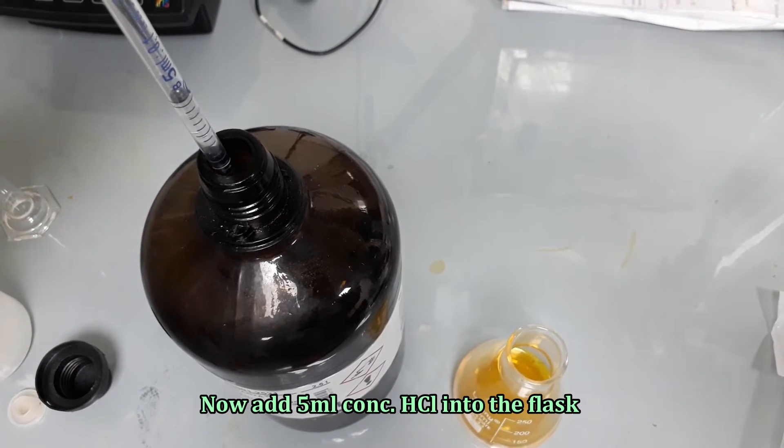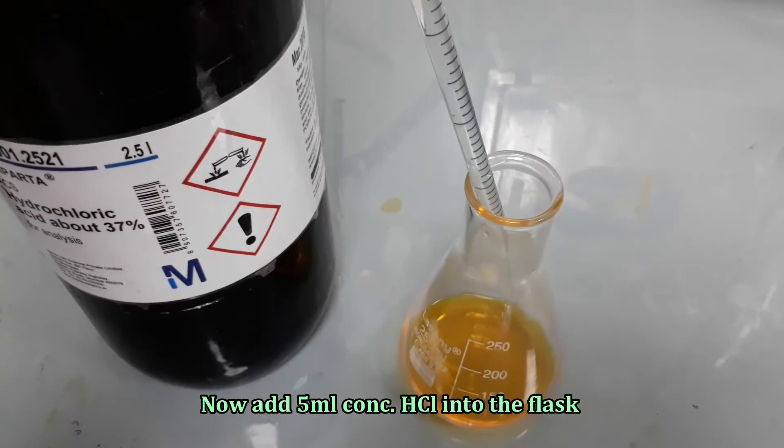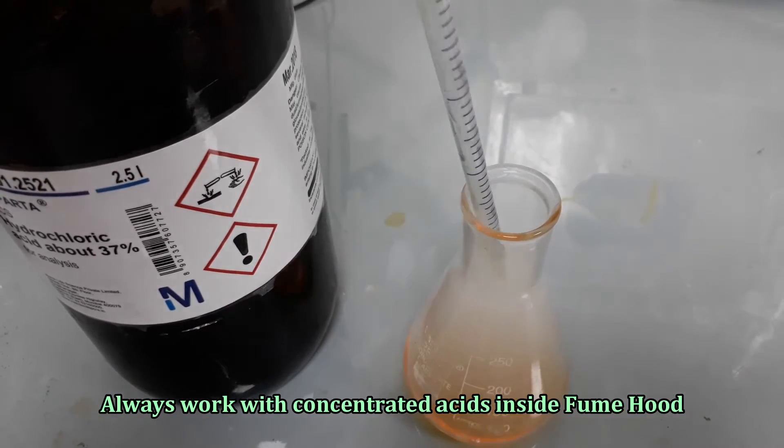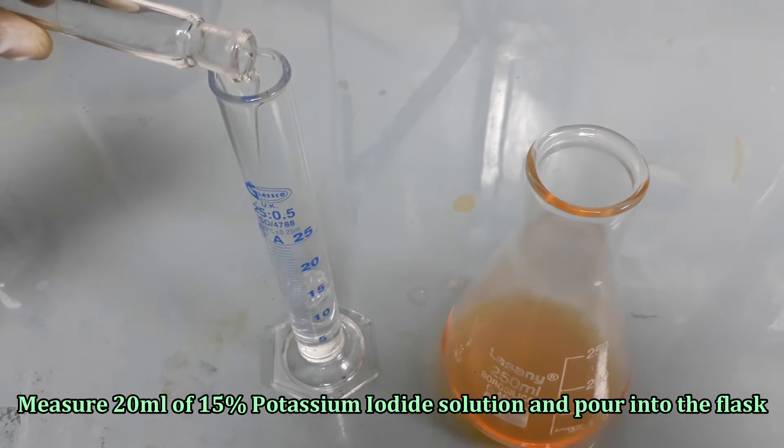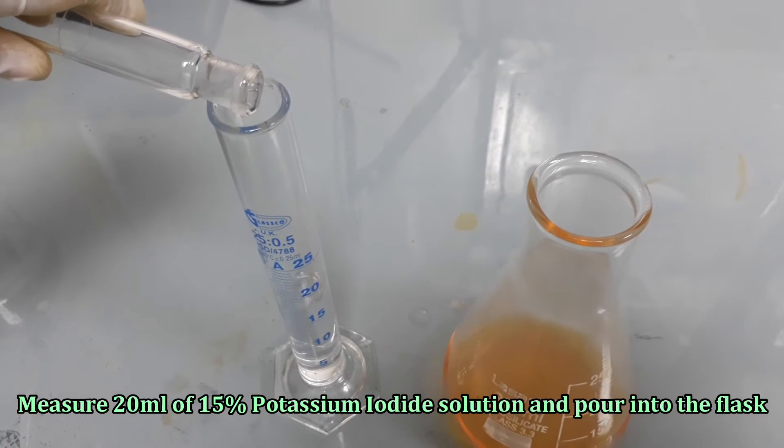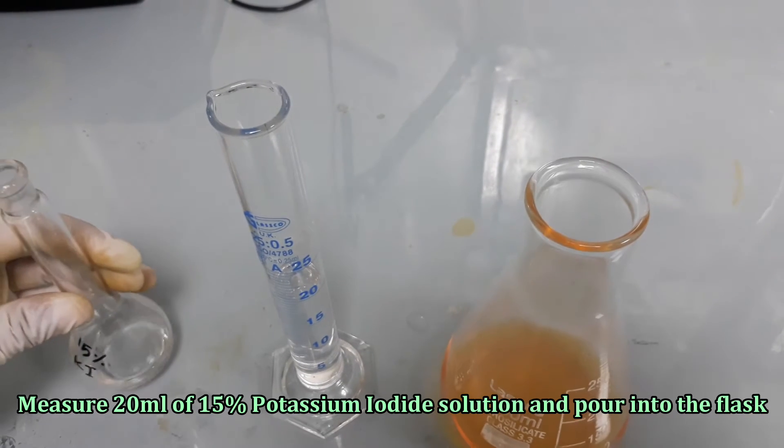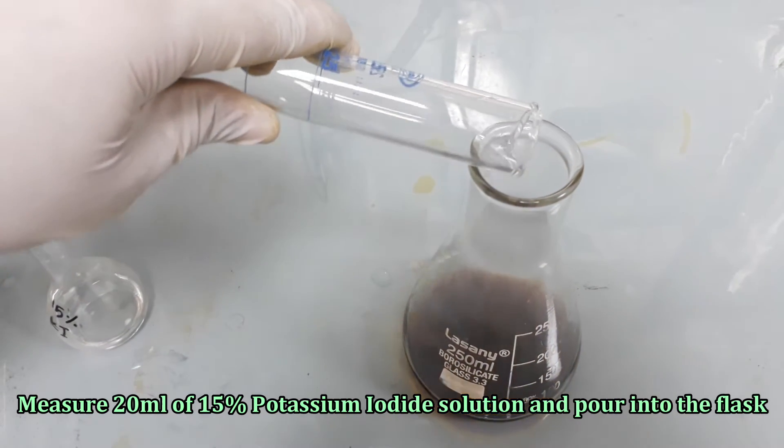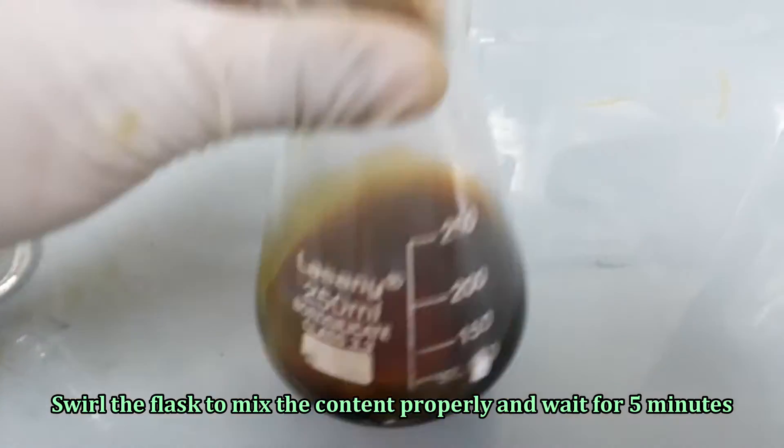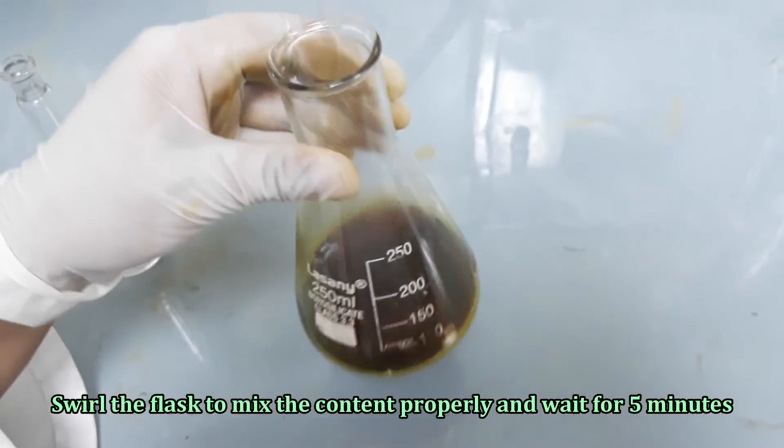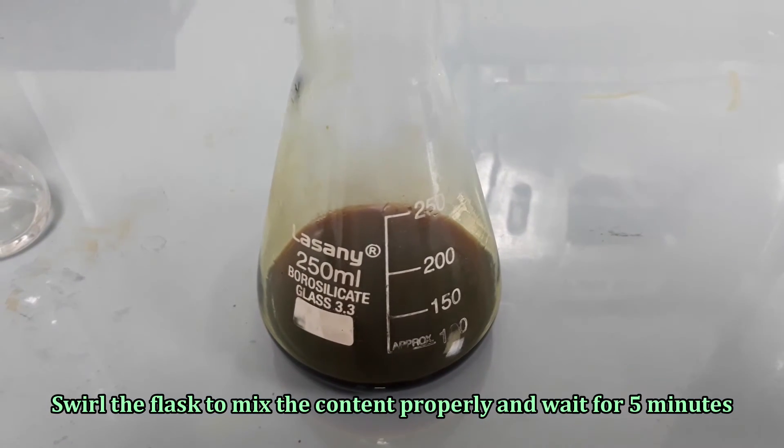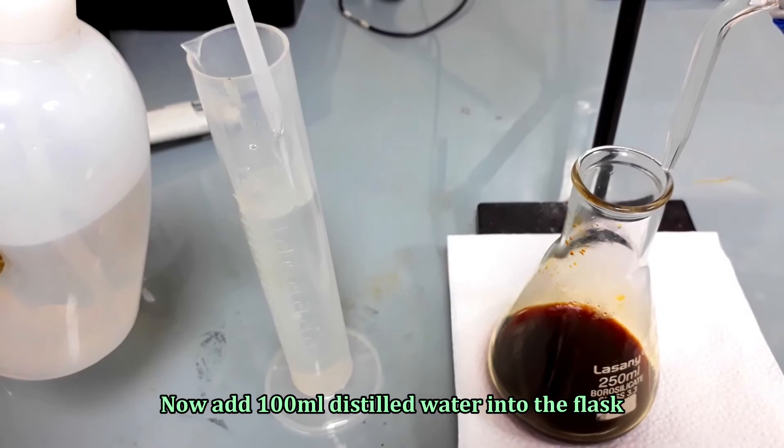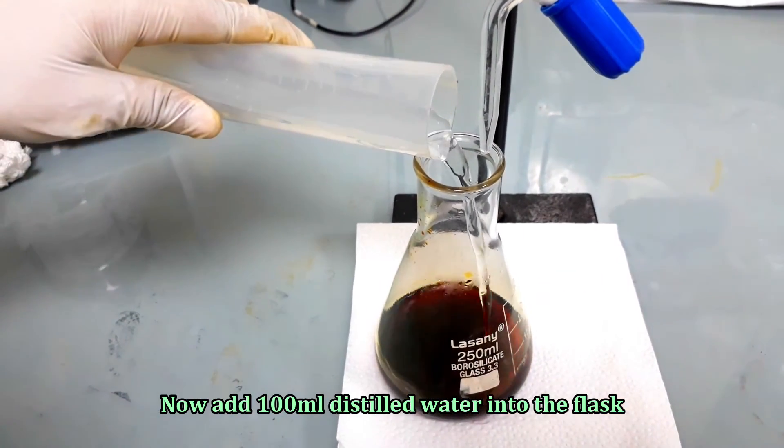Now, add 5 ml concentrated hydrochloric acid into the flask. Add 20 ml of 15% potassium iodide solution into the flask. Swirl the flask again and wait for 5 minutes. Add 100 ml distilled water and swirl the flask to mix the content properly.